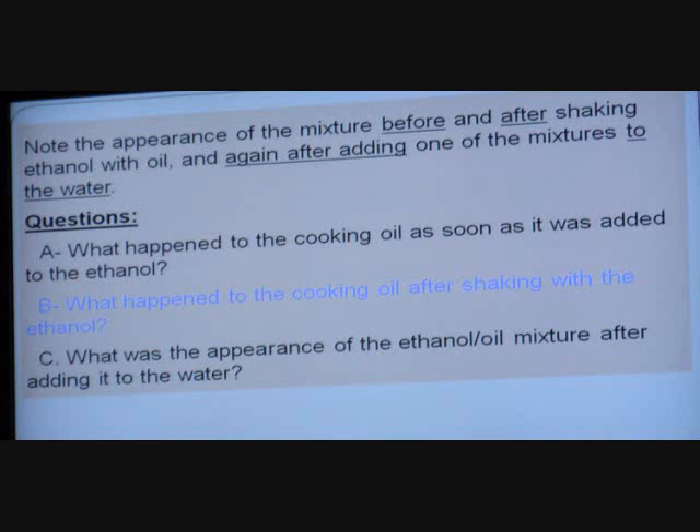This is a body care experiment. I'm going to use three test tubes over there — I've got rubbing alcohol in two of them, about two fingers' worth. I want to know what happened to the oil when I dropped it in the ethanol, then after I shook it up, what happened to the oil, and after adding water, what happened to it. Right now I don't have a clue.